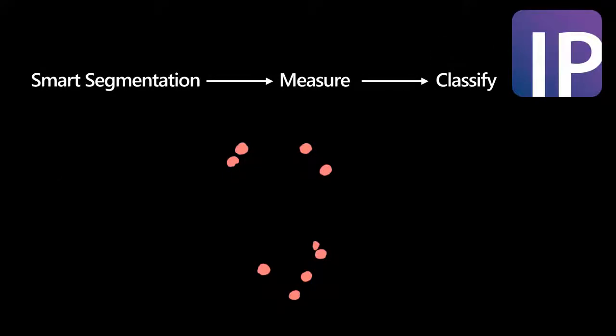After determining the population of objects, a third refinement stage is available to classify the objects. Classifying the objects into categories allows the user to statistically report on groups of structures rather than individual objects and by doing so develop more meaningful results.